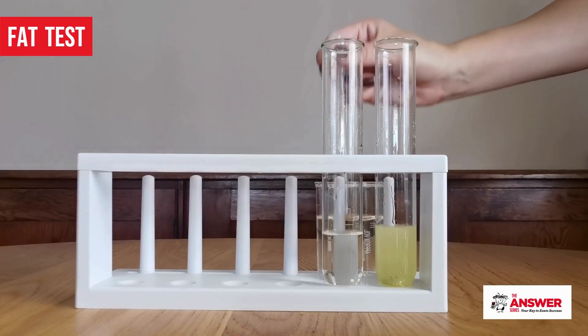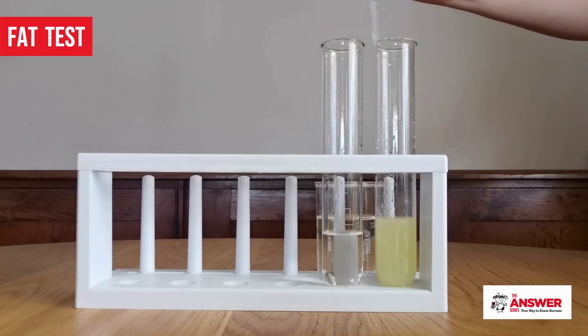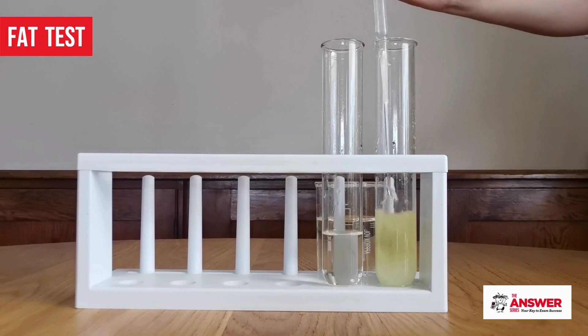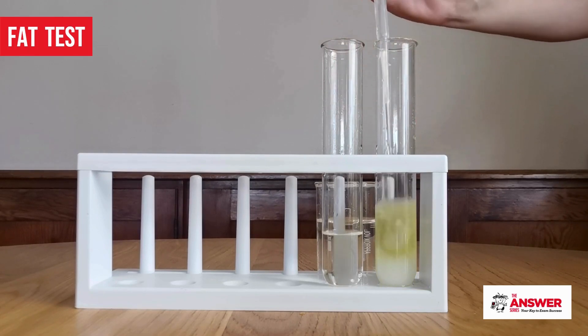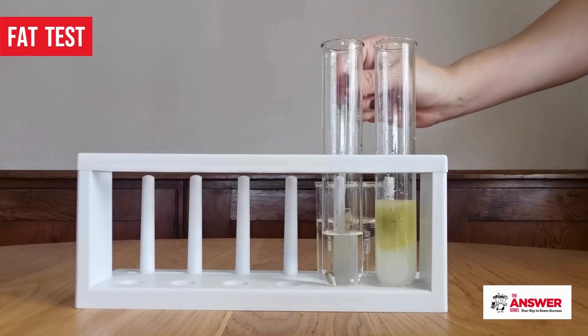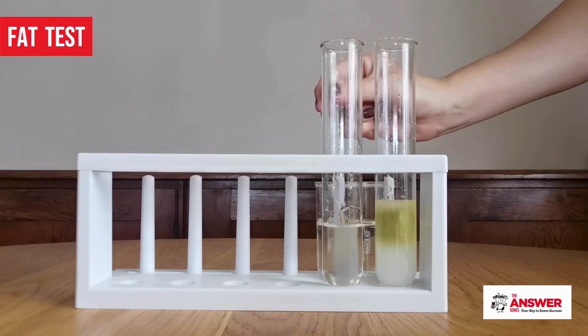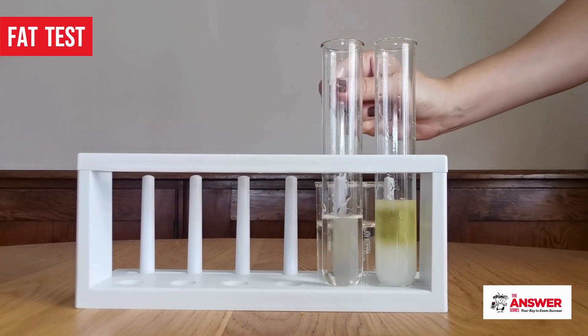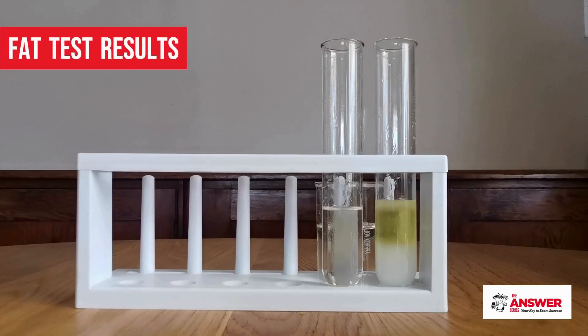Now add 5 milliliters of water to each test tube and observe the reaction. A clear solution indicates a negative test for fats, whilst a cloudy or milky emulsion indicates a positive test for fats.